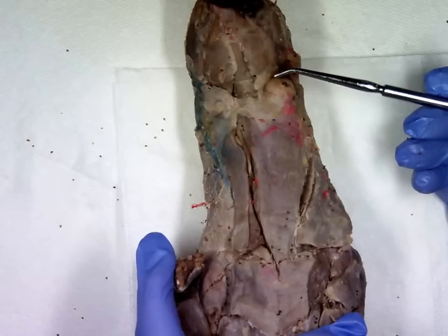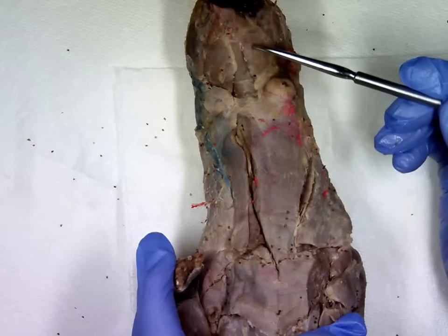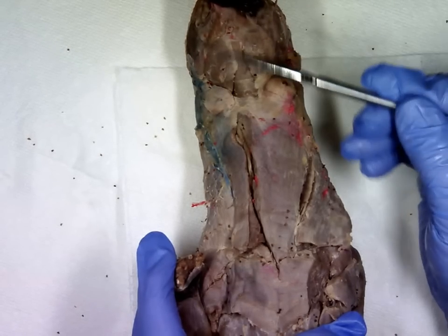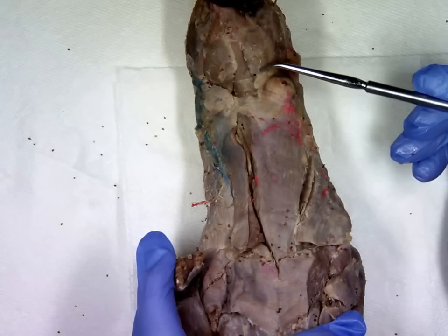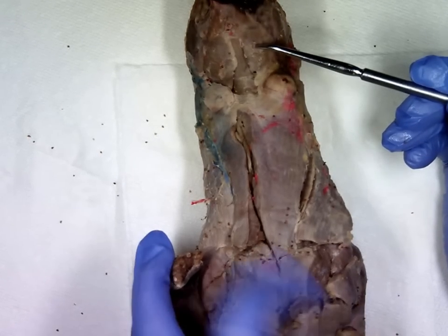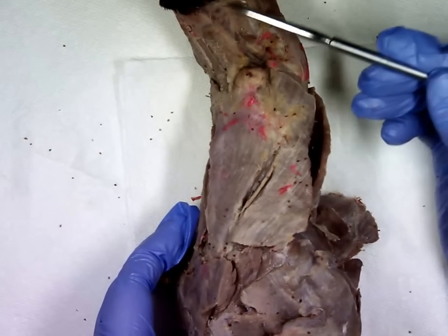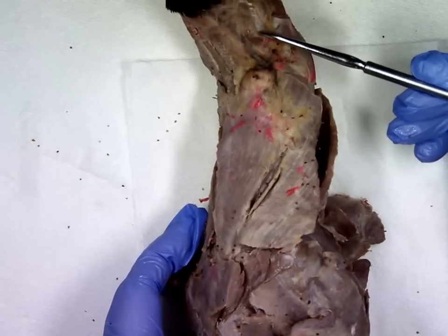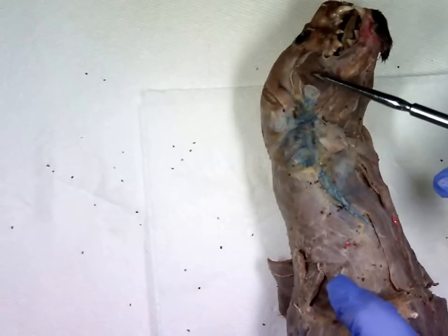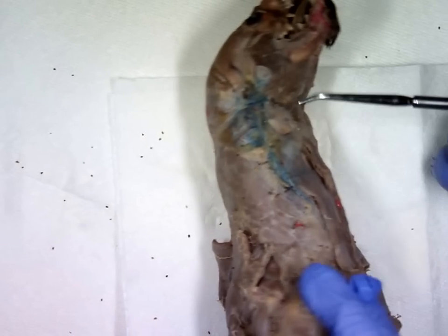Let's look at the muscles found on the actual head of the mink. Find your mandibular glands and go directly superior to them. This muscle below the mandible of the mink, found bilaterally, is the digastric muscle. You don't need to know the muscle on the inside. Then lateral to each of the digastric muscles you have some large round cheek muscles — this is the masseter, which we can see on both sides of the mink.